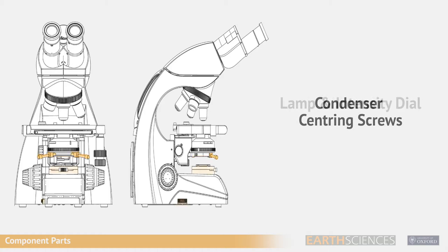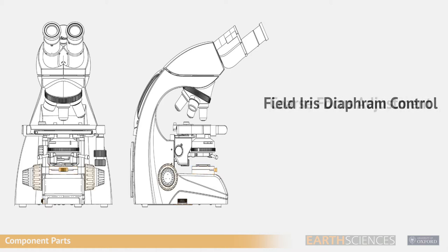Condenser centering screws, lamp and intensity dial, field iris diaphragm control, coarse focus adjustment, fine focus adjustment, mains cable socket and cable tidy, and main switch.